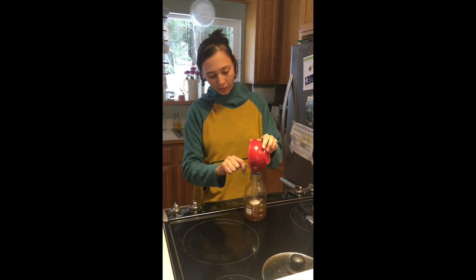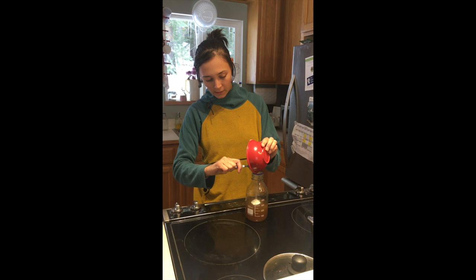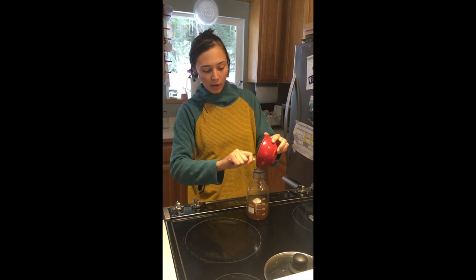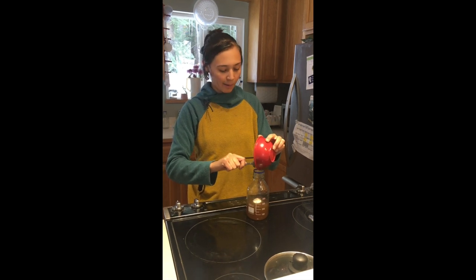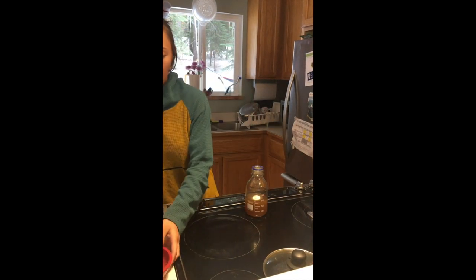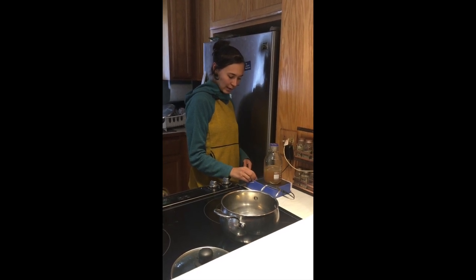Normally when I'm pouring agar plates, I'll have my media bottle filled up with 500 milliliters, or half a liter, of grain soaked water and 10 grams of agar powder. If I'm not using grain soaked water, I'll do 500 milliliters of regular tap water and then put in 10 grams of agar powder and 10 grams of malt extract.